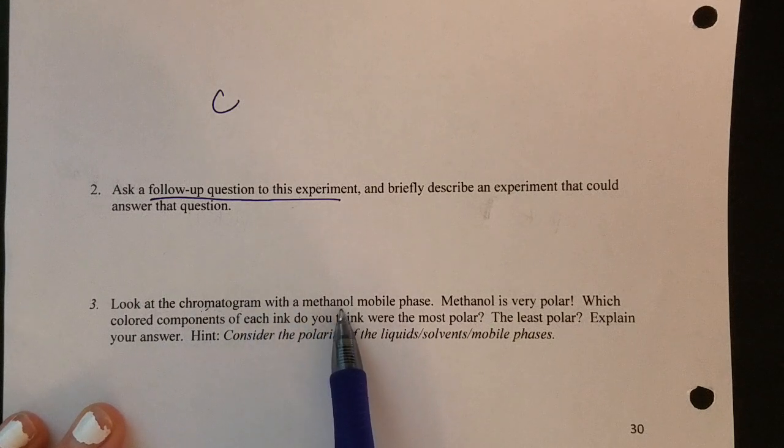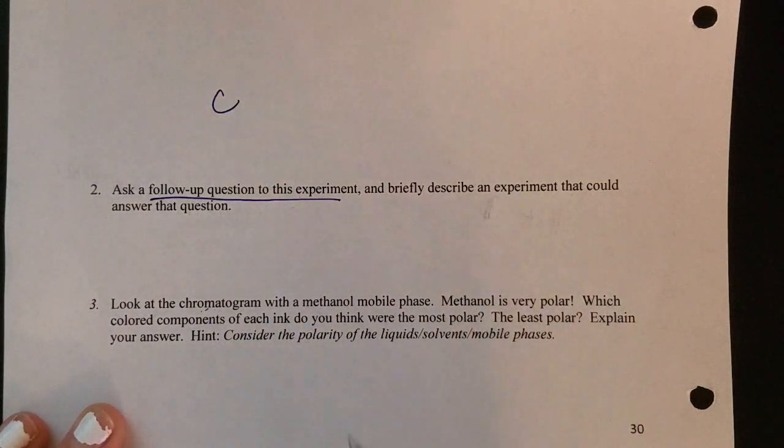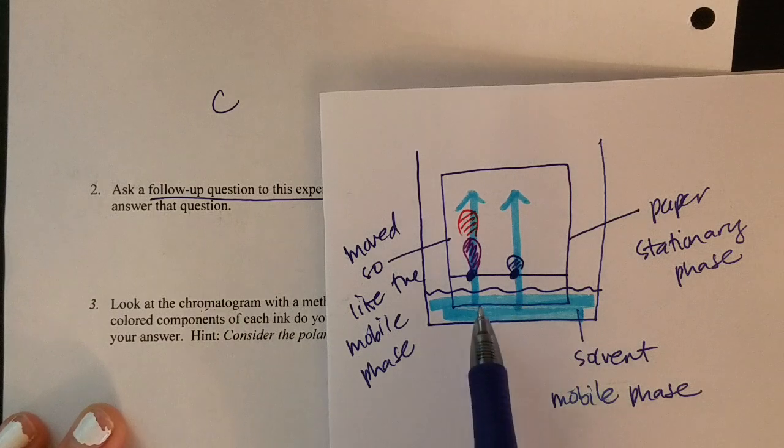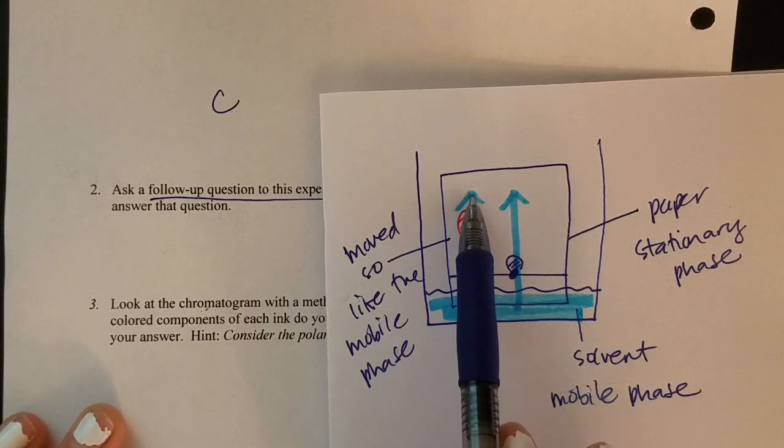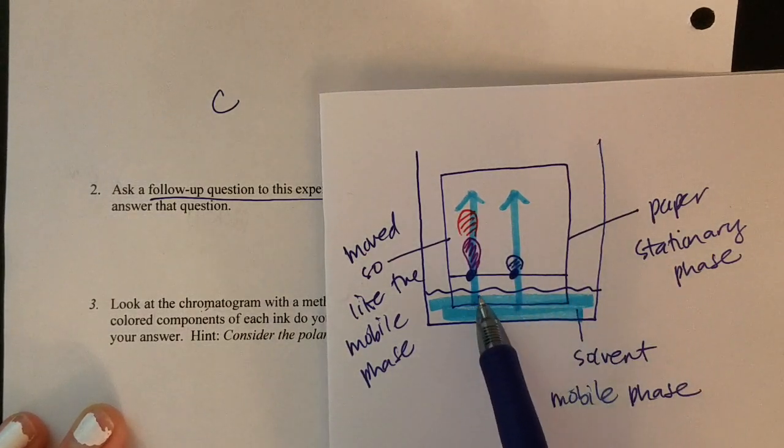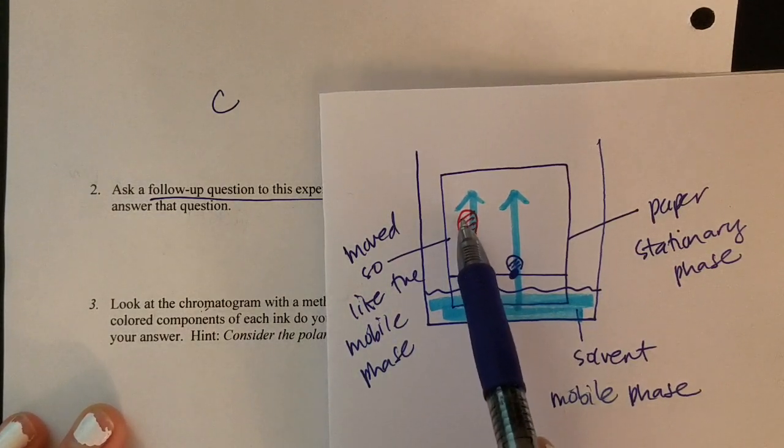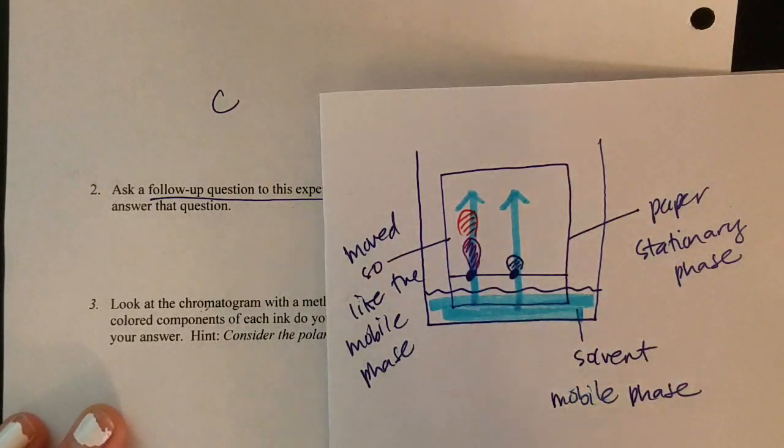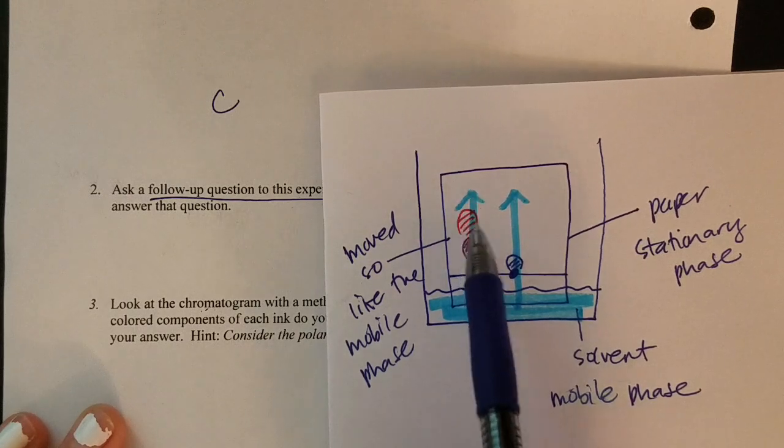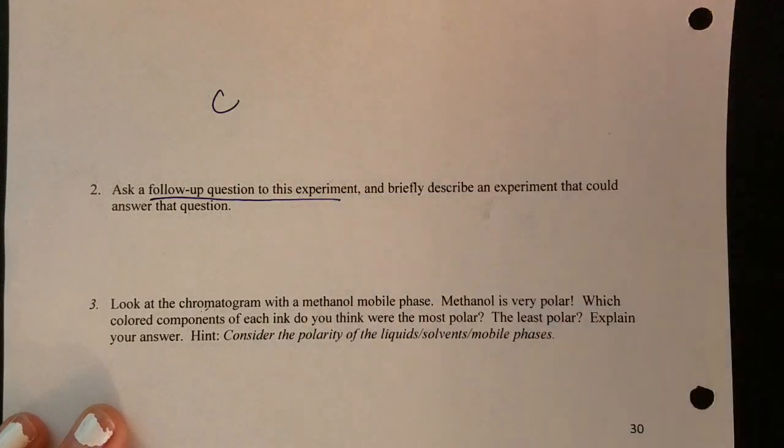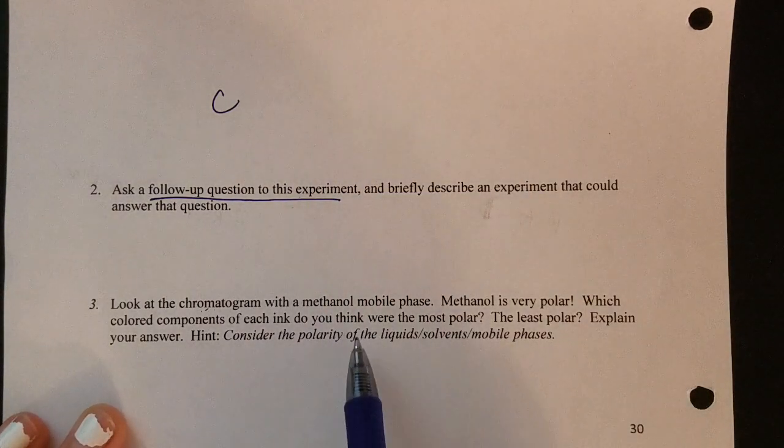And then lastly, you're going to look at the chromatogram with the methanol mobile phase. And you're going to answer which of the colored components of each ink you think were most polar. So that would be coming back to a picture like this. If my blue solvent is polar, then whatever moves furthest with it would be most polar. So I would say for this ink that the red component is more like the mobile phase than the purple component. So say this blue was methanol, I would say the red is more like methanol than the purple. So you want to have that kind of mindset as you work on number three here.